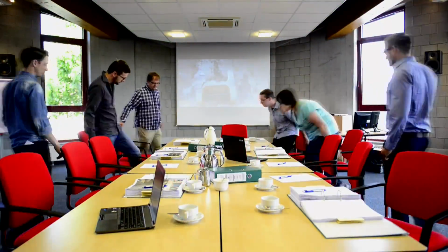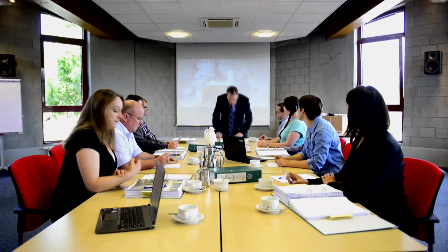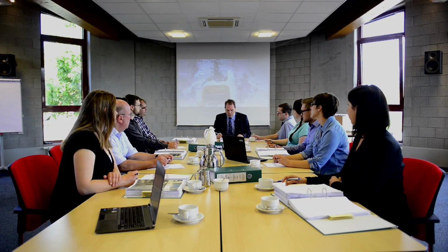In staff meetings, a most diverse range of damage cases are freshly placed on the table and discussed in a resource and solution-oriented manner. An everyday example: screws for fixing electrical connections in household appliances. These were broken, resulting in the recall of 33,000 appliances. We have to check whether the screws were actually hydrogen embrittled or not. Mrs. Van Tol, this is a job for you to look into.